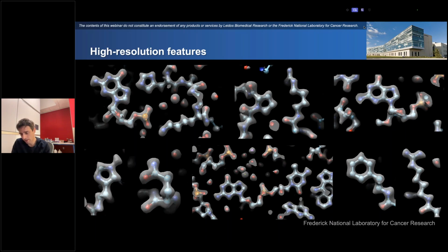So in theory, since a carbon-carbon bond is longer than that, you actually have the potential to be able to separate atoms, but we're not there yet, even in the core. But it does get confusing about exactly how you interpret this density. And that problem doesn't exist in crystallography, because in crystallography, at this resolution range, you wouldn't see contribution from the hydrogens.